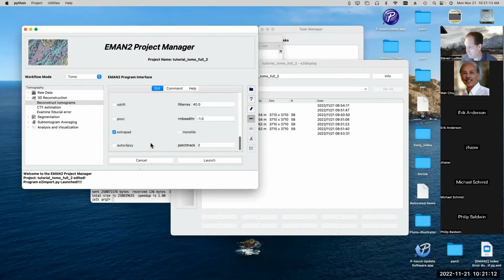Okay, Steve. Yeah. I have a completely different kind of pipeline where we're trying to annotate vesicles and find the tops and sides and bottoms of things, and locate microtubules in the cell and kind of get those things. I understand.